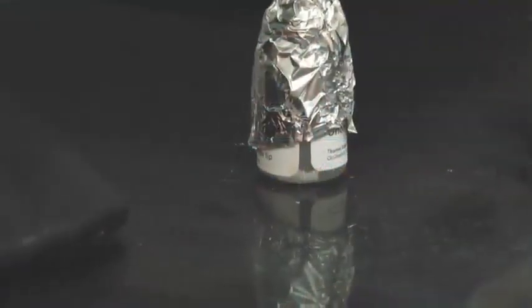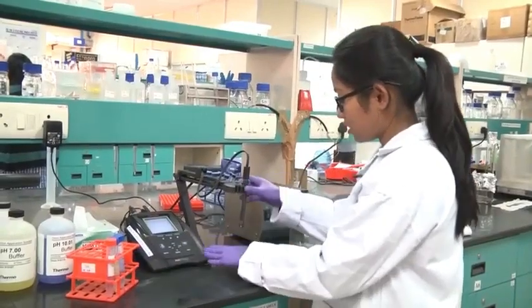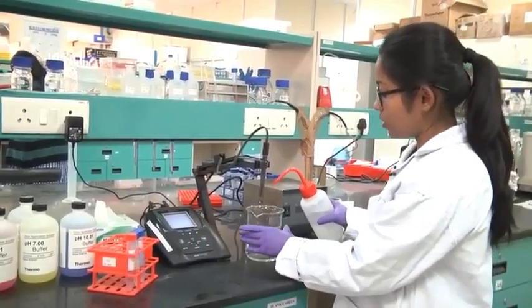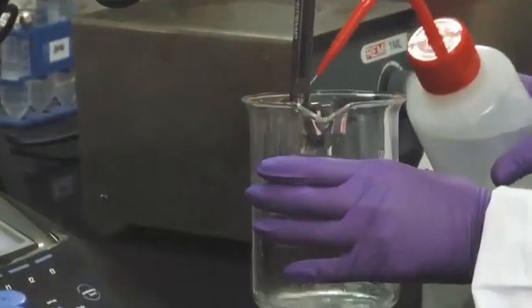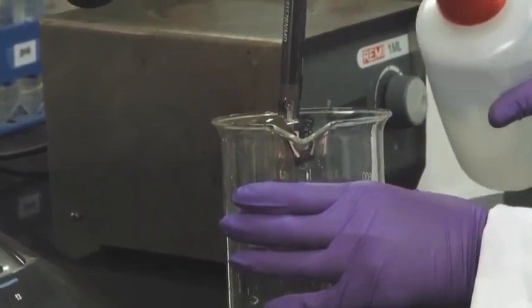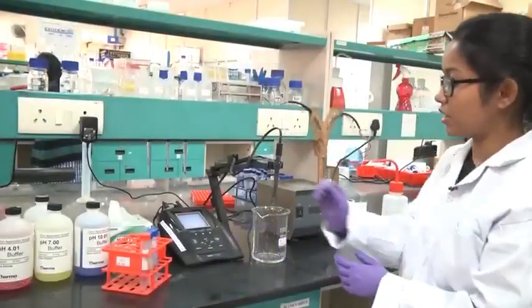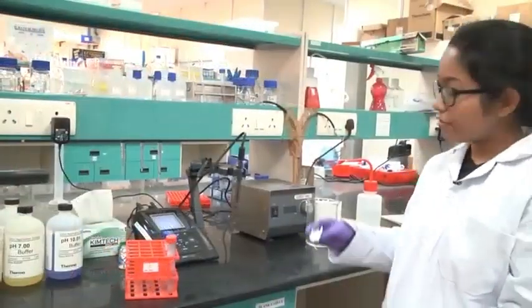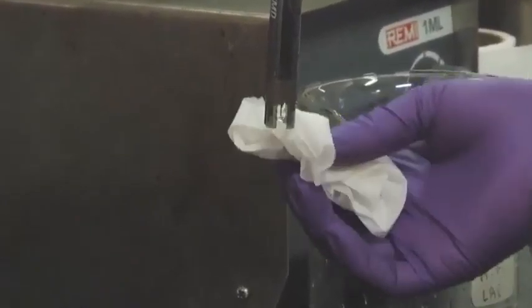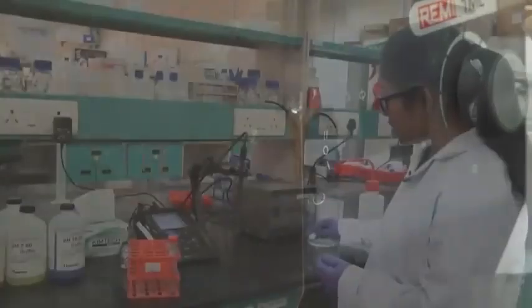In order to do the pH meter calibration, first I will take out the probe from the storing solution. As I mentioned earlier, before you dip the probe in any solution, you have to wash it thoroughly with deionized water. While washing, do not damage the probe, and always use deionized water. After you wash the probe, dab it with a clean tissue paper. Do not rub the probe, otherwise you might damage it, as it is very sensitive and fragile.